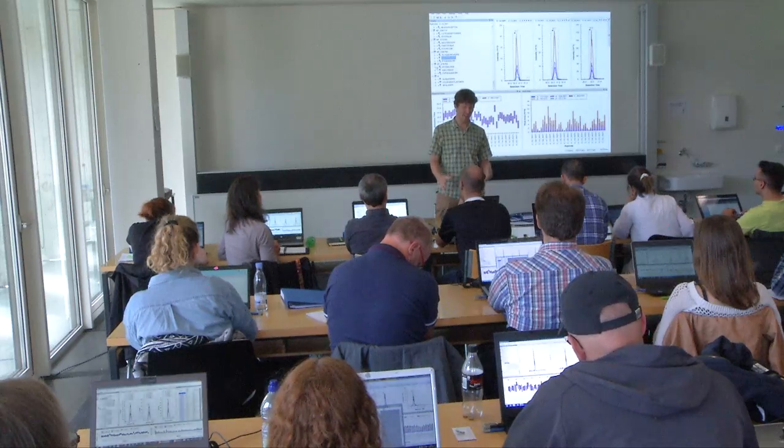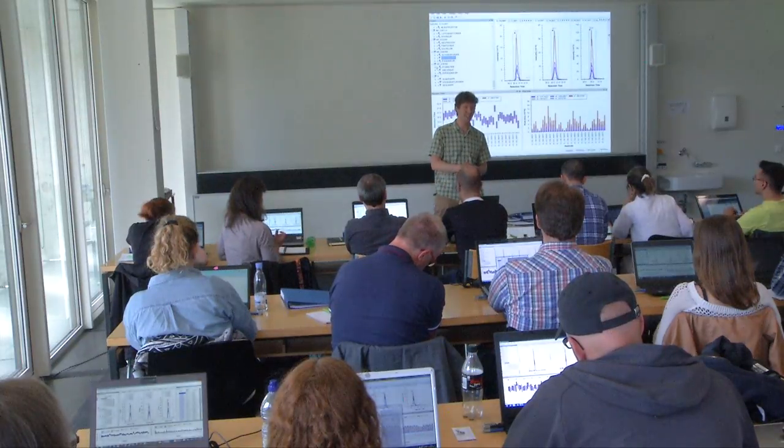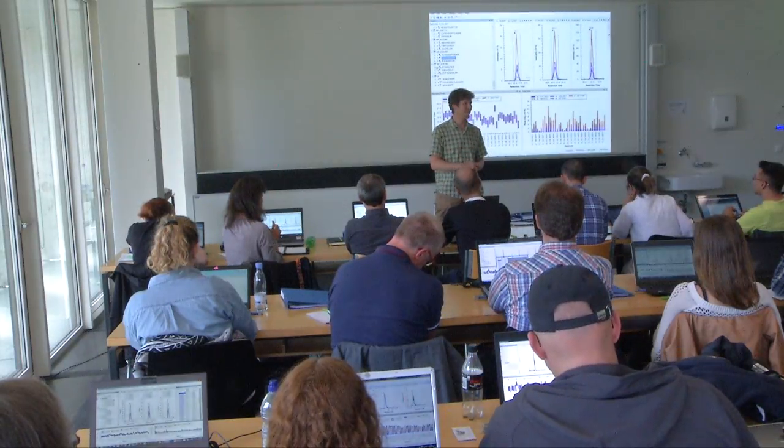And so I'll leave you with that, and we'll get into some more exploration. There's lots to be explored about this data, and we've just started. So thanks.